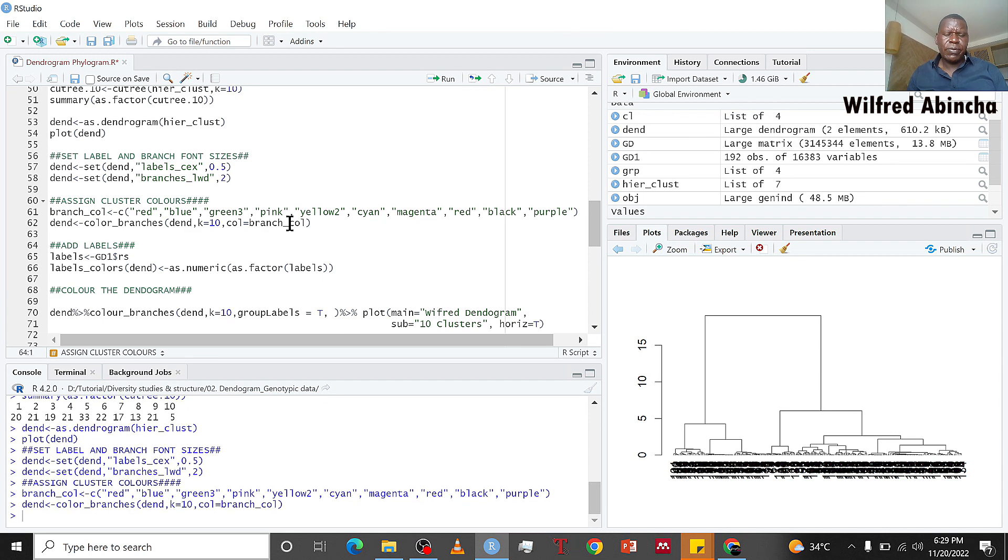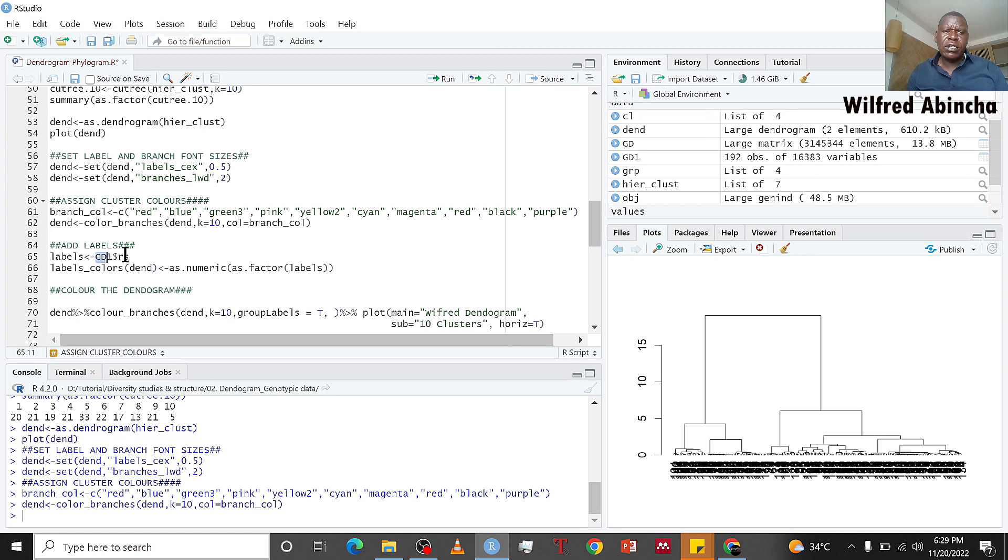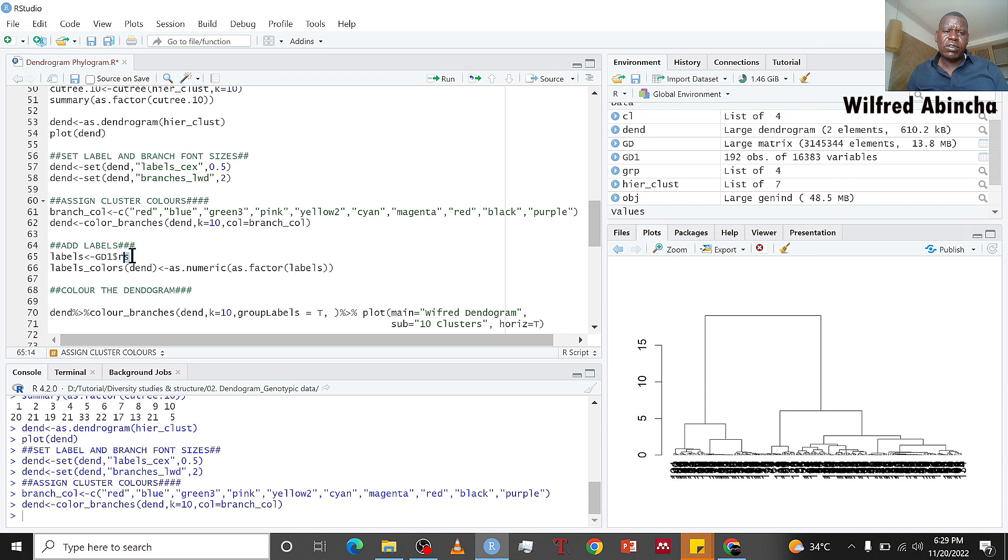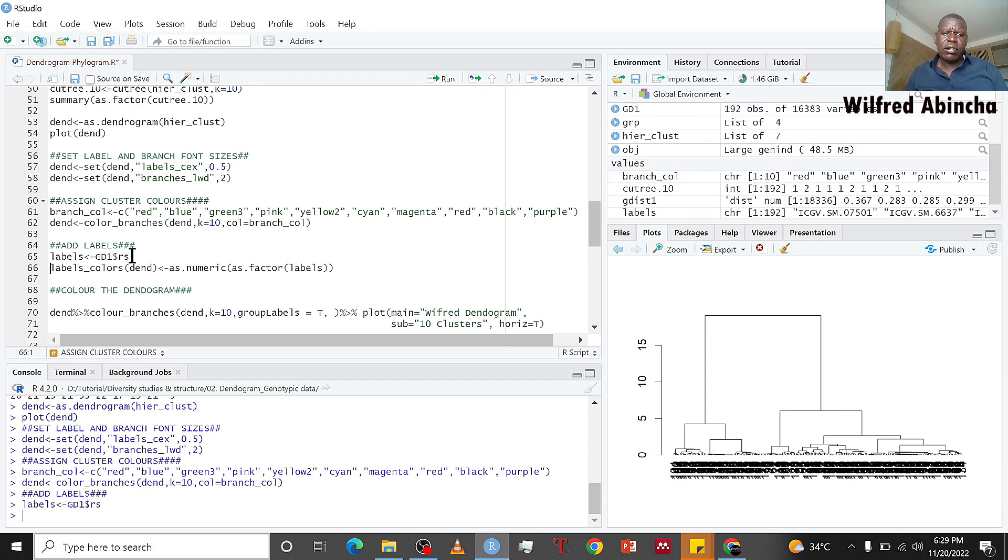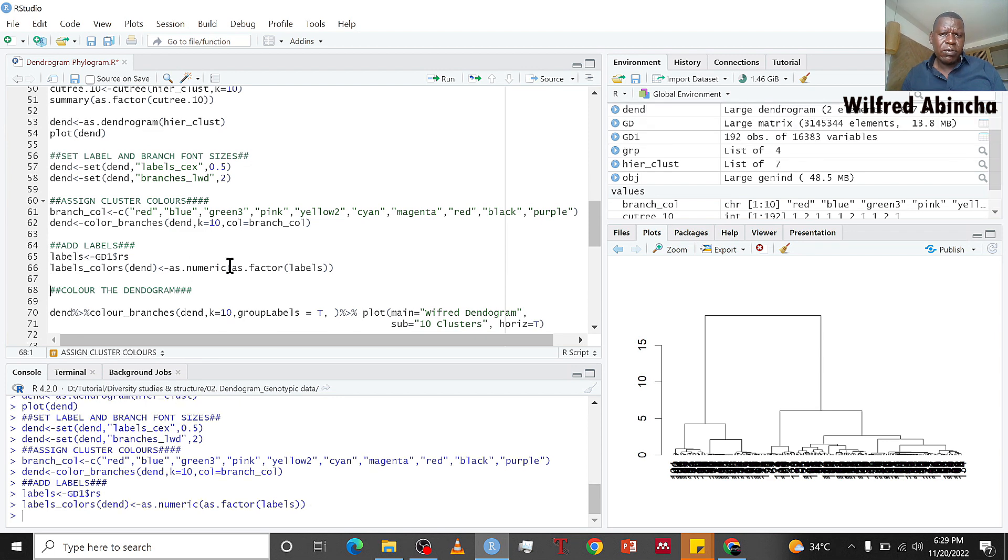Now we want to put our labels. Our labels were in gd1 that we imported. The first column was the individual names. So labels is gd1 first column, and we are going to find this as numeric.